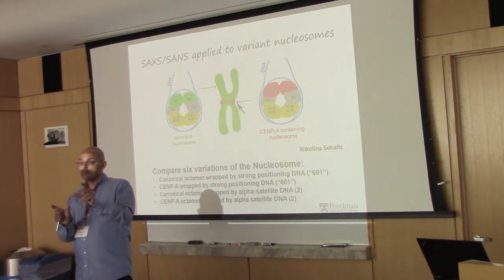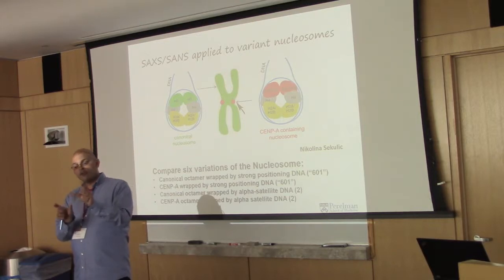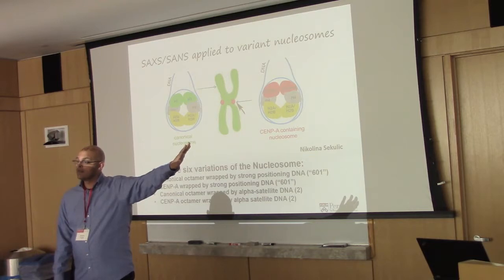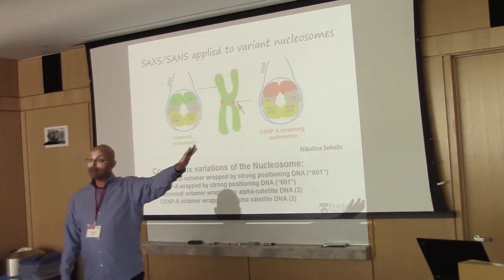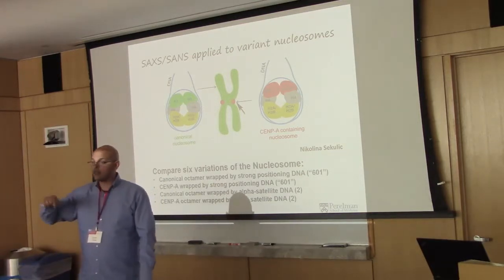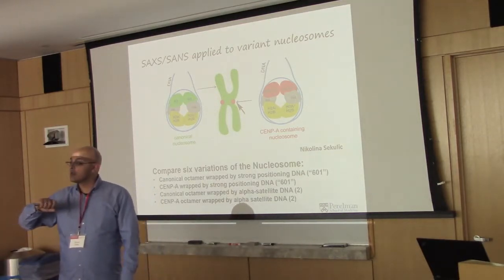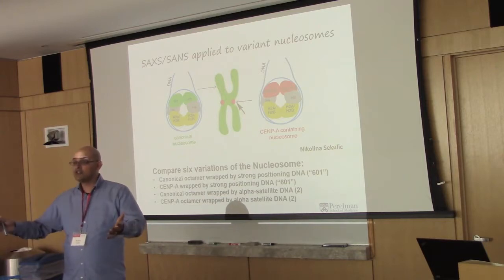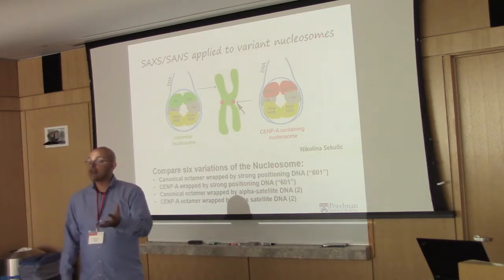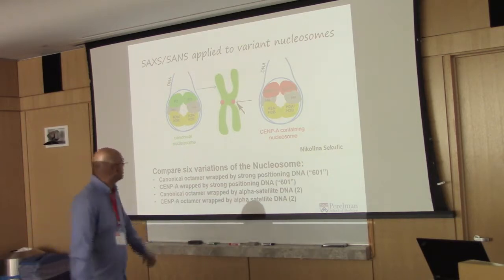Protein is 50% of the nucleosome, another 50% is DNA. 30% of that protein mass is entirely unresolved in protein crystallography: the business end of things, the histone tails, the N-termini, the 30 or so amino acids on each of the 8 histones in a histone octamer. We don't have any information on that from other direct techniques, but here you can ask questions and account for that inventory in our analysis.